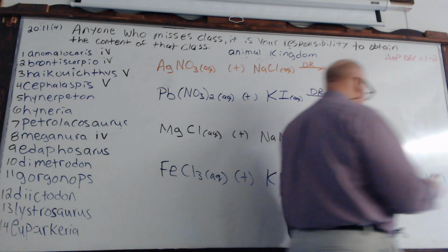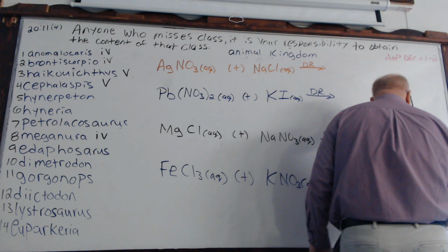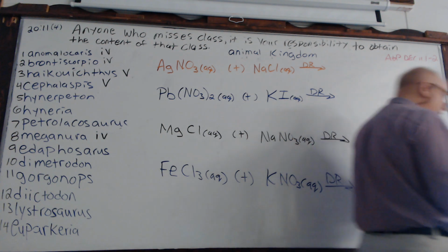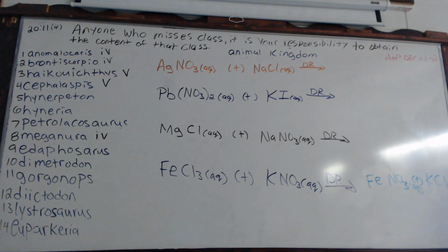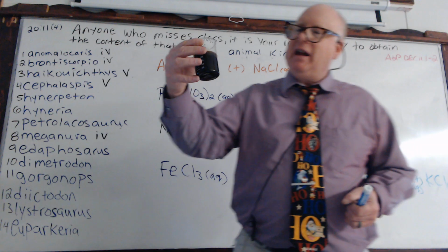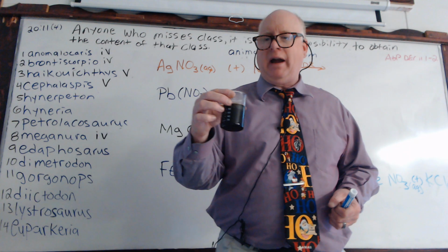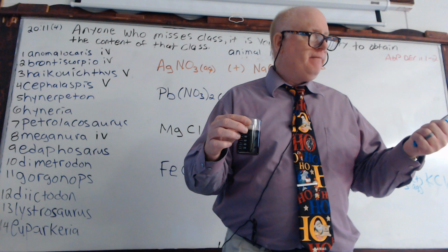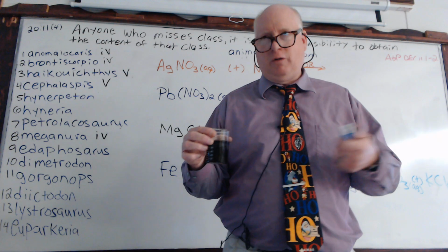So what we just observed is that this remains in an aqueous state, and this remains in an aqueous state as well. Like I had mentioned, you might say it became a deeper red. That might be true. The reason is, think about hemoglobin. What does hemoglobin mean to you?